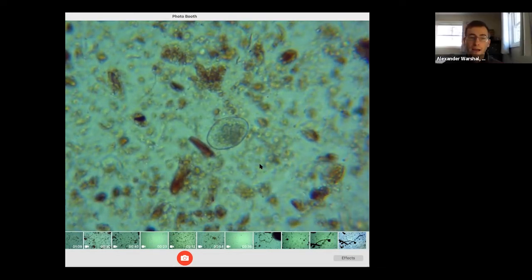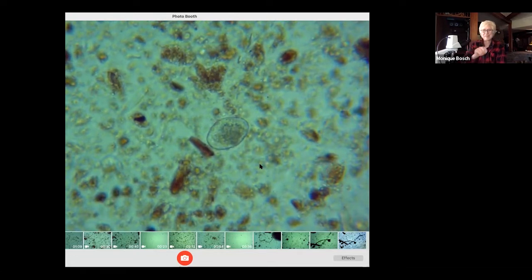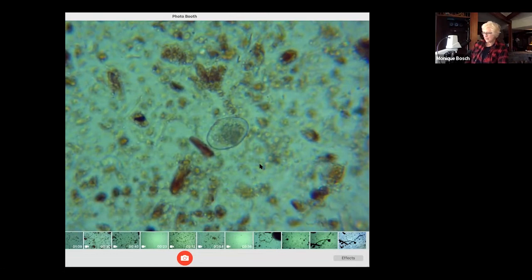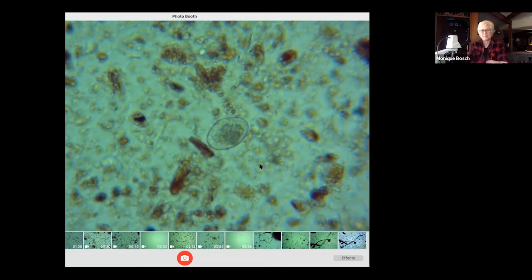Sue and Carrie both ask, what brand of microscope do you have? Like the make and model. Okay, how do I get this to you without losing my train of thought? It's an Omax, because I have a link to it. On Amazon, the Omax compound microscope with video connector, and it's $324. I can't look it up right now, so hopefully you can find it.